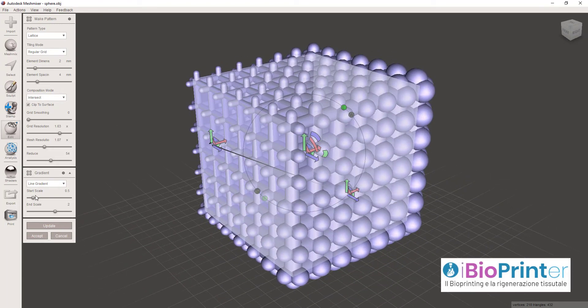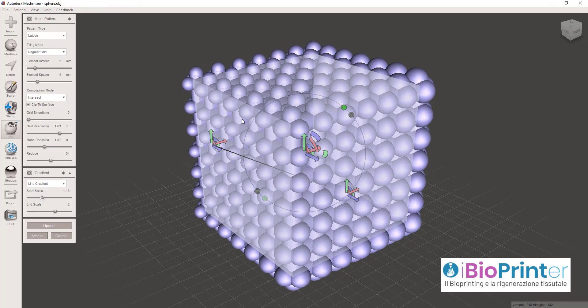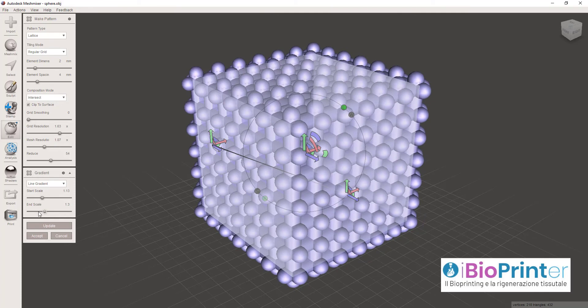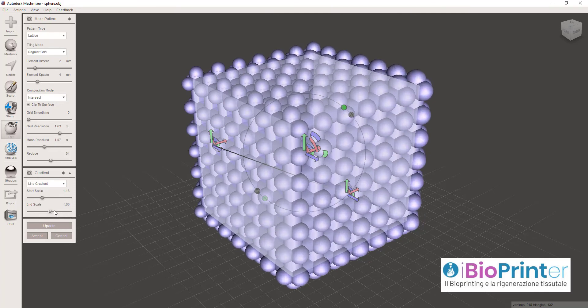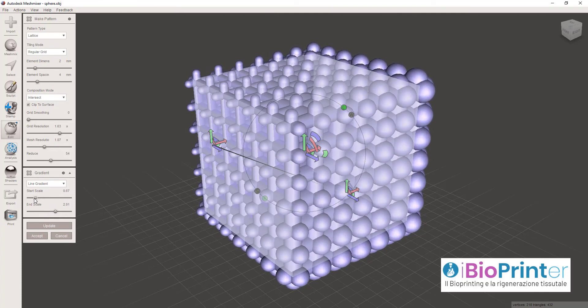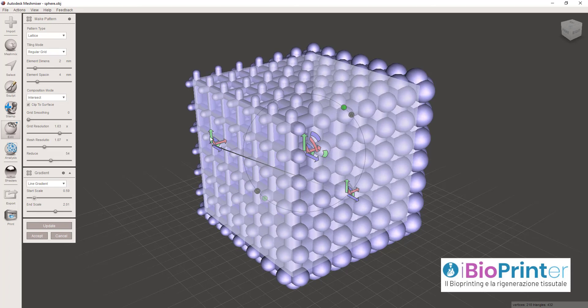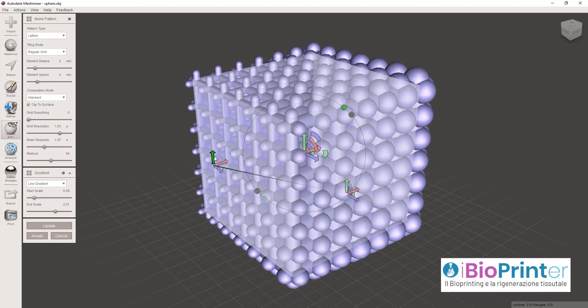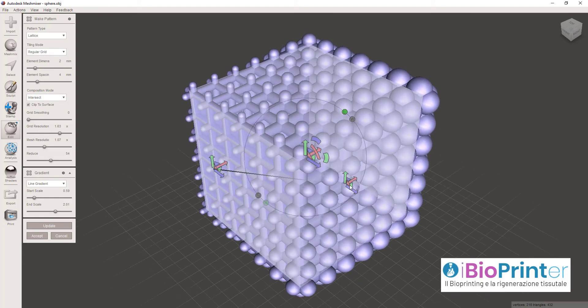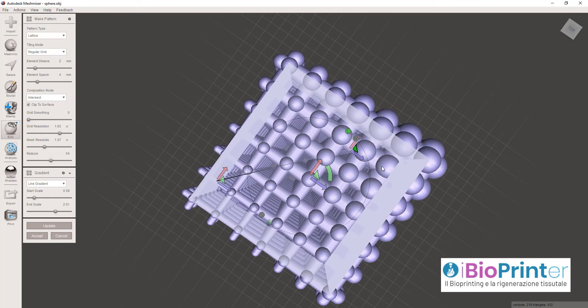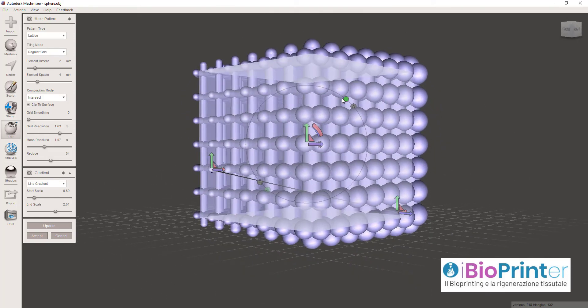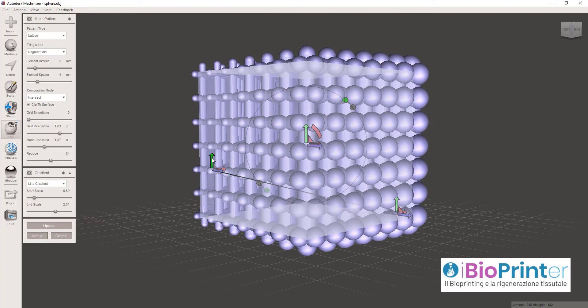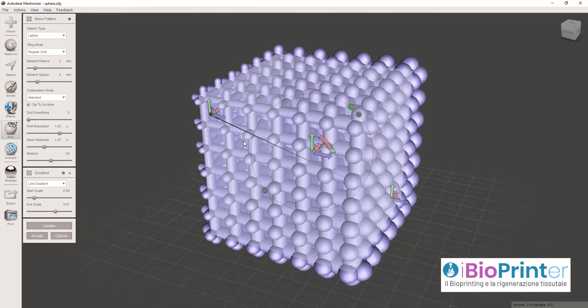Possiamo scegliere una scala all'inizio del gradiente e una scala alla fine. Aumentando la scala alla fine, otteniamo uno scaffold con elementi più piccoli nel punto dove origina il gradiente e più grandi dove il gradiente finisce.